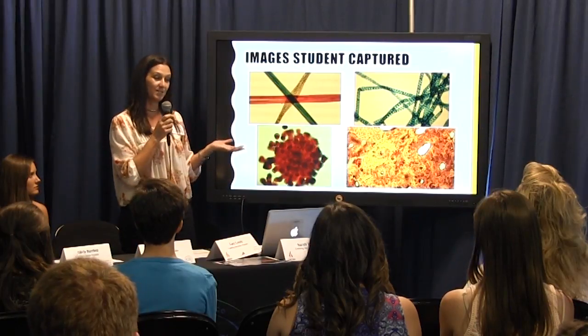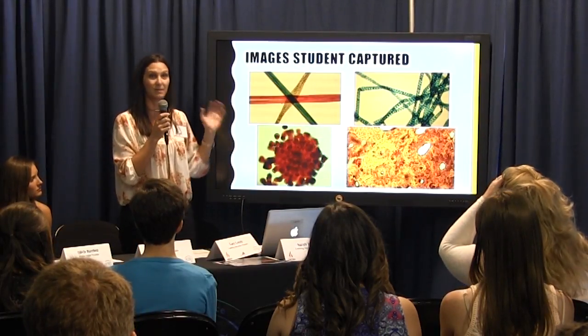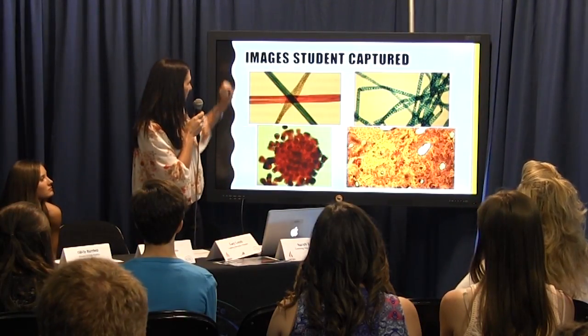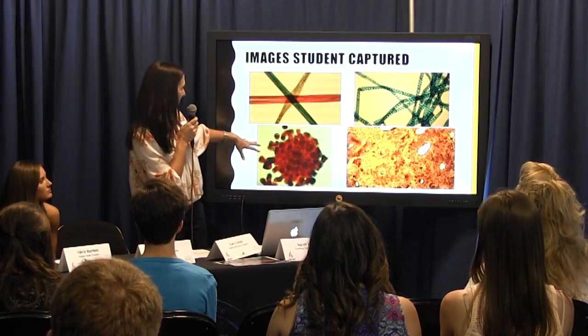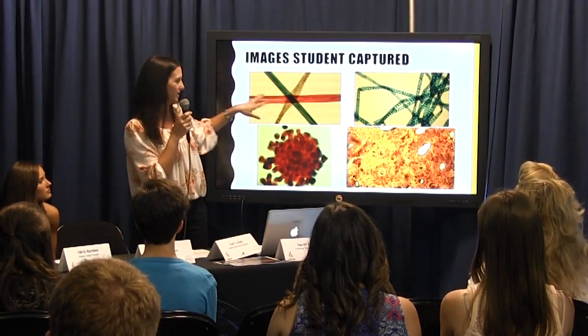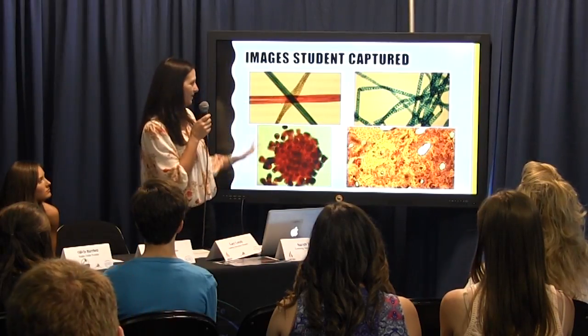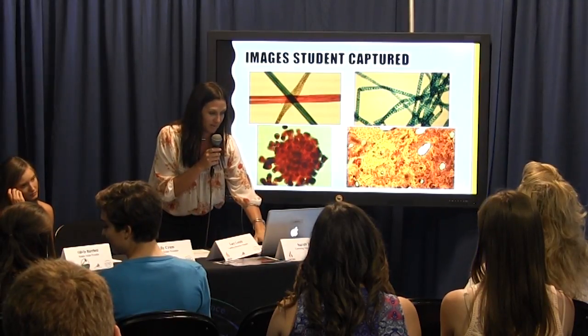So here's some images that you could totally see on Google, these pictures. They actually took these pictures. So that was one. Here was spiral gyra. You've got vorticella. These are some protozoa, algae, bone tissue. But I thought these are really good. There were so many, I couldn't go through all the great ones.